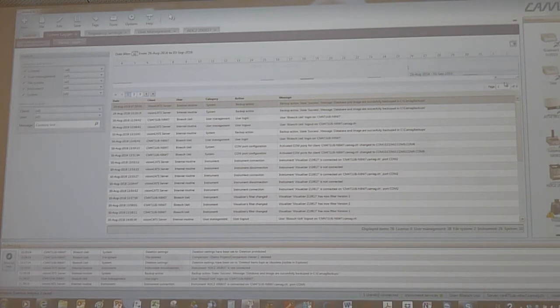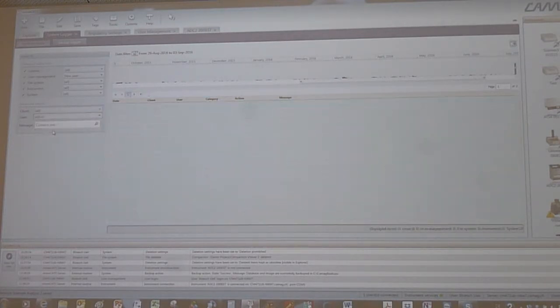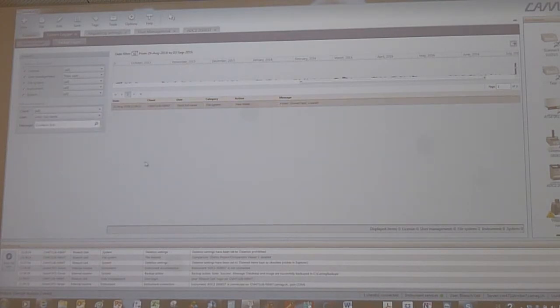Also here I can choose, I can say, okay, I just want this kind of data. Then I want to have the new user section, and then from what user. Admin hasn't done anything, it's a lazy guy. So the test-full guy did one in this period. So maybe I can go further on, maybe here, no, didn't make more.